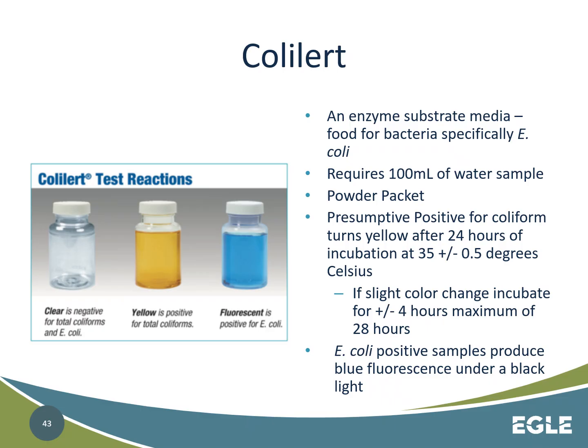So Colilert is an enzyme substrate reaction, probably the most commonly used bacterial method in most of our water plants. How this starts out is you have a 100 milliliter sample, which requires at least 100 milliliters. The sample bottle will be dechlorinated because there will be sodium thiosulfate within the bottle. The bottles need to be sealed before the sample is taken. If you go to take a bacteriological sample and the bottle is not sealed, you should not use it. Throw it out, get a new one.